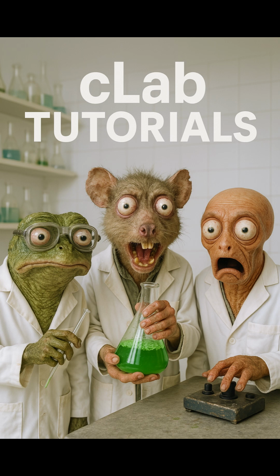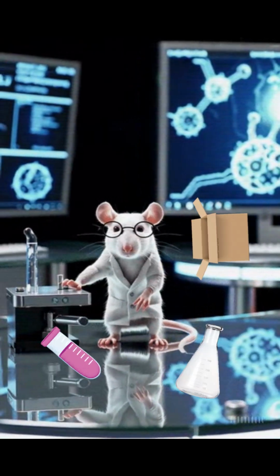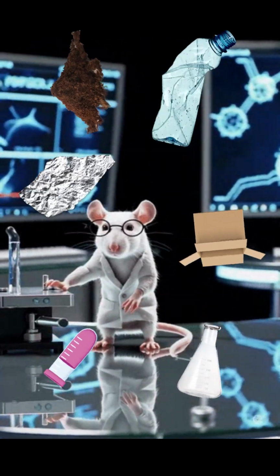Hello and welcome to cLab tutorial number 2.1, which is all about solid waste disposal. In this video, we'll show you how to properly dispose of various solid waste materials generated in the lab. That includes cardboard, tubes, glass, soil samples, aluminum, and PET bottles.